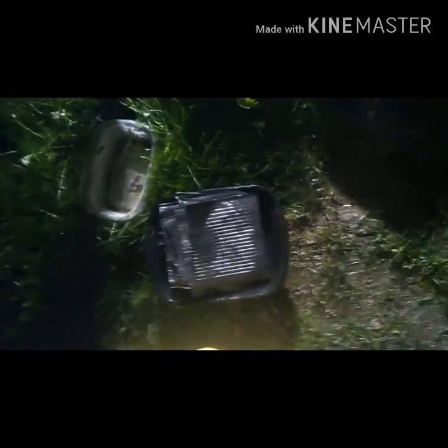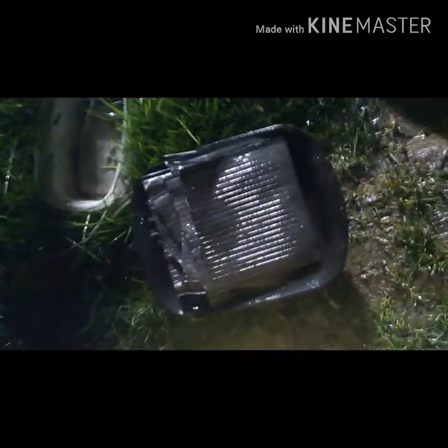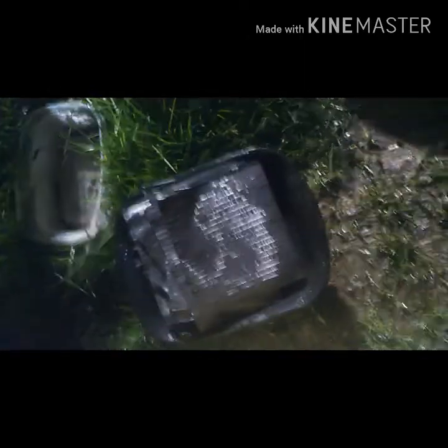Today I'm gonna be taking the red lead oxide out of a battery, turning it into litharge and then into gray lead oxide. In these bags here is the gray lead oxide from a battery, and in here is the red ones. The red ones have lead 2 and 4 oxide; the gray ones have just lead 2 oxide.